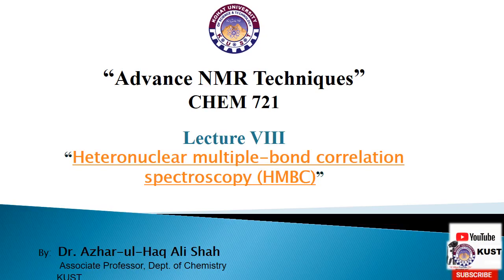In our previous lectures, we have discussed different NMR techniques, that is proton NMR, carbon-13 NMR, COSY, NOESY, etc. And we have come to know how these techniques have been helpful in elucidating structure of organic molecules.